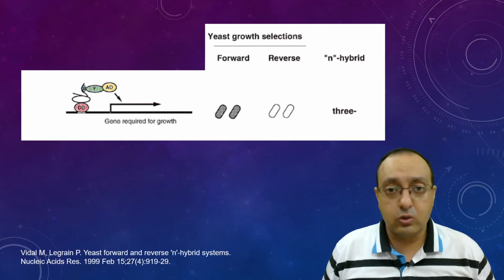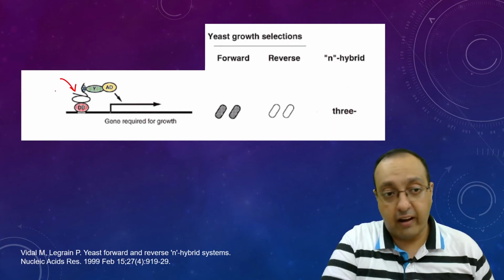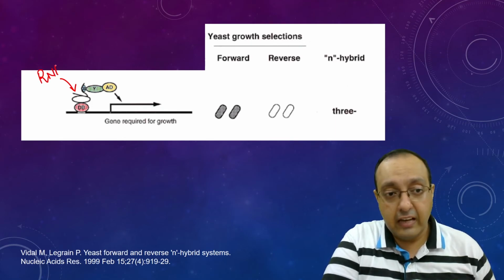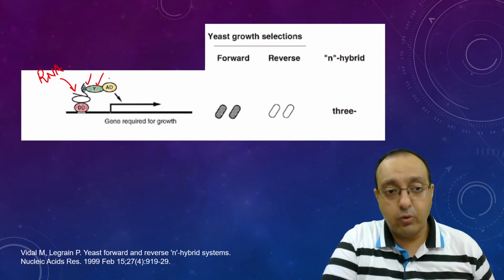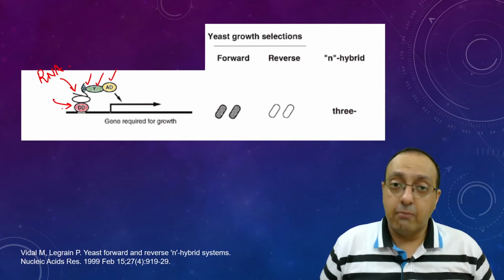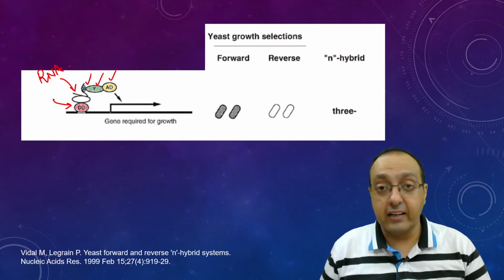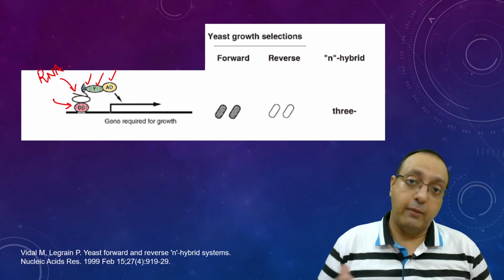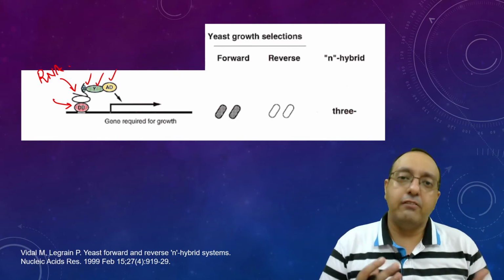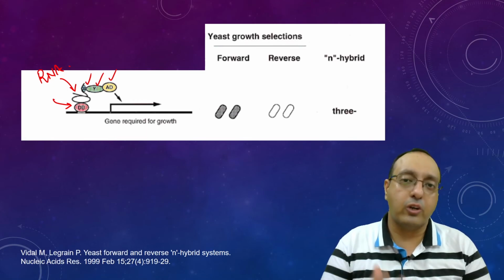The Three-Hybrid system was also a pretty interesting derivative where we looked at RNA-protein interactions. Here we have X protein, Y protein fused to the activation domain, and the DNA binding domain fused to another protein, along with the intermediary RNA. So we are screening for RNA-protein interactions. Basically, we have covered RNA-protein, DNA-protein and protein-protein interactions.